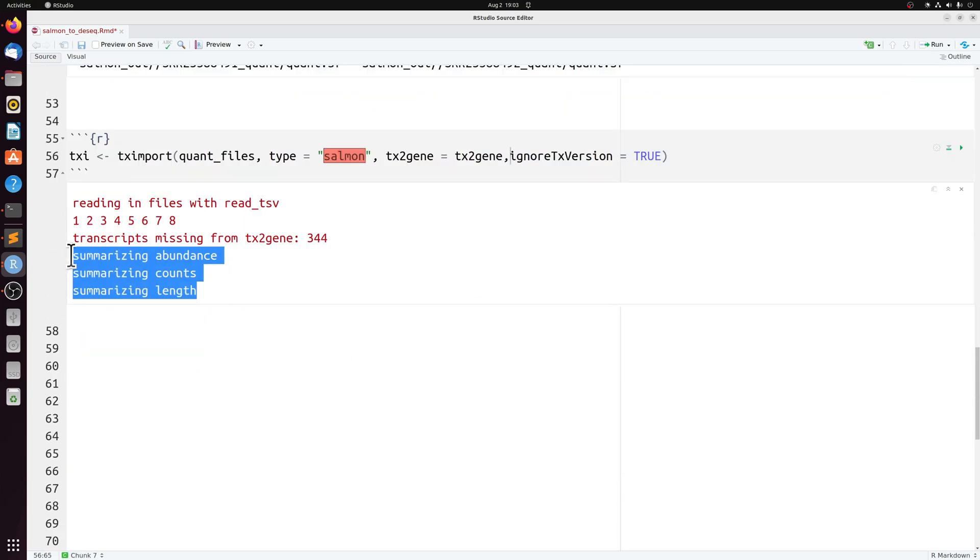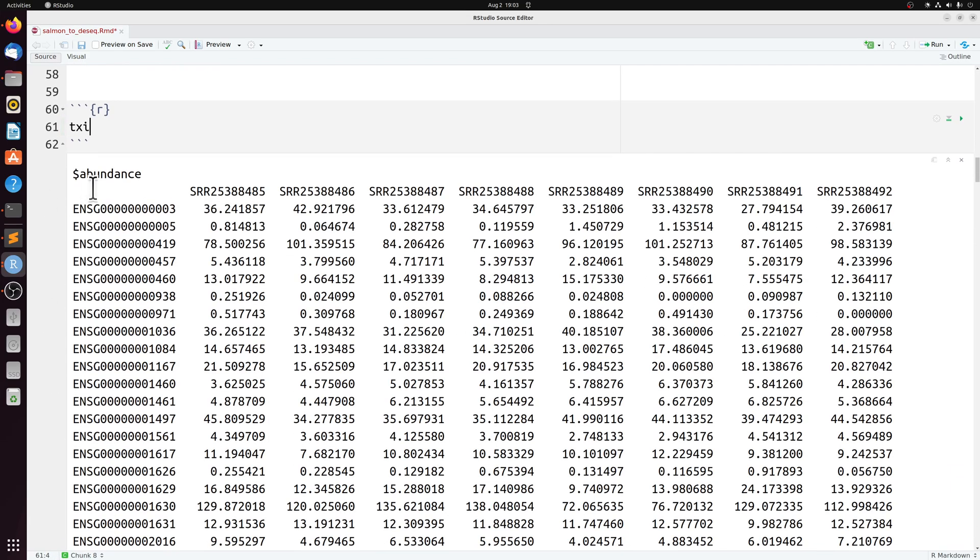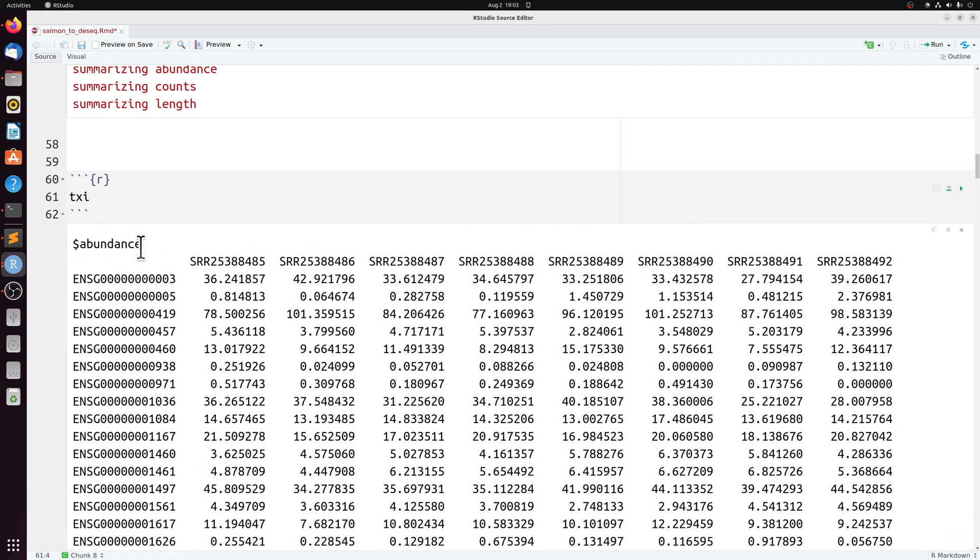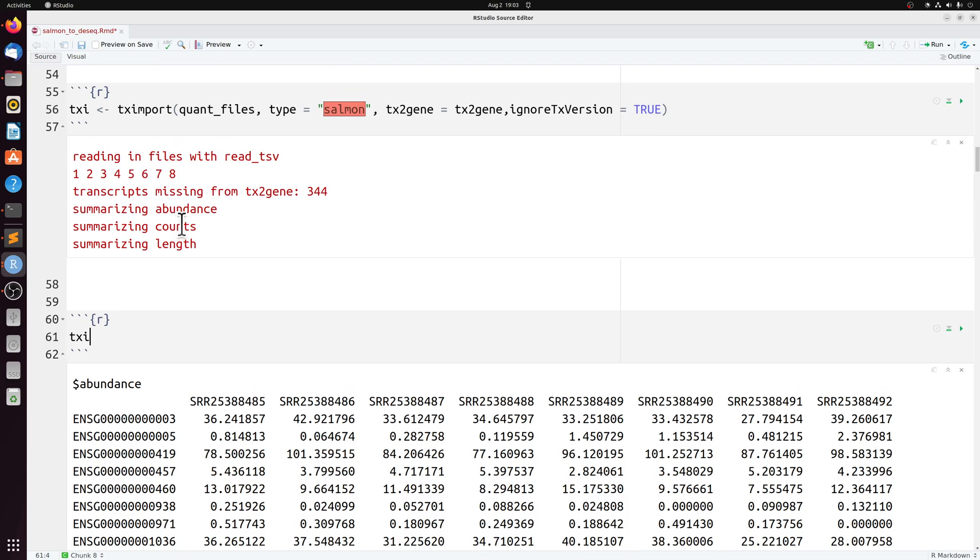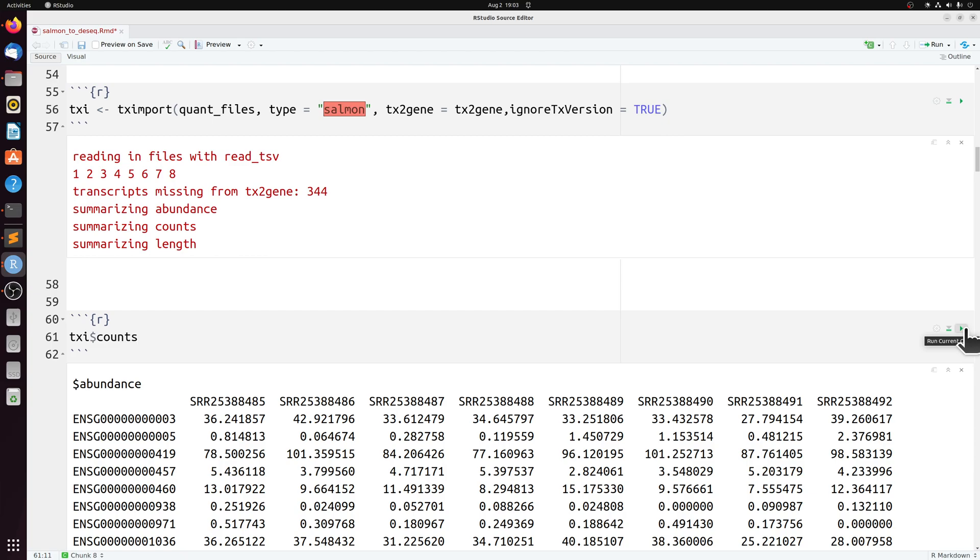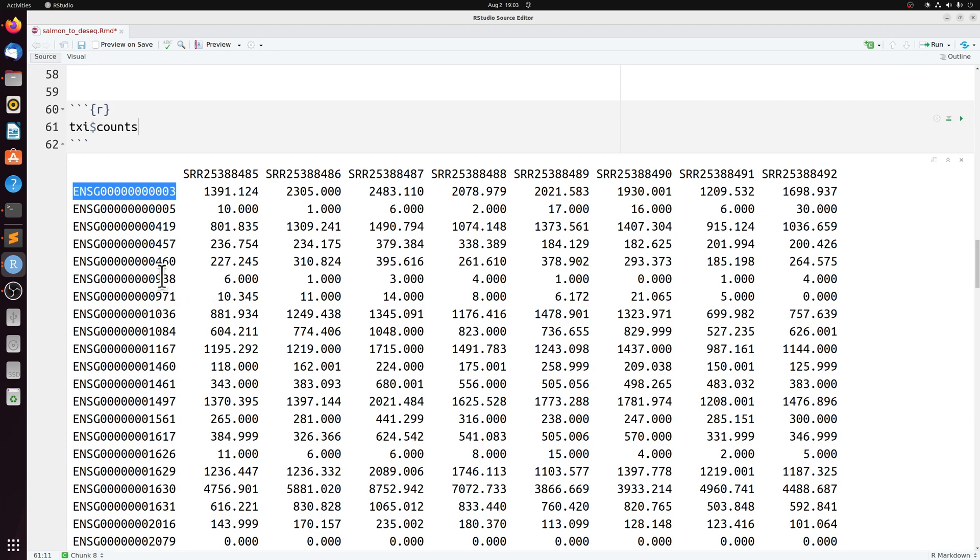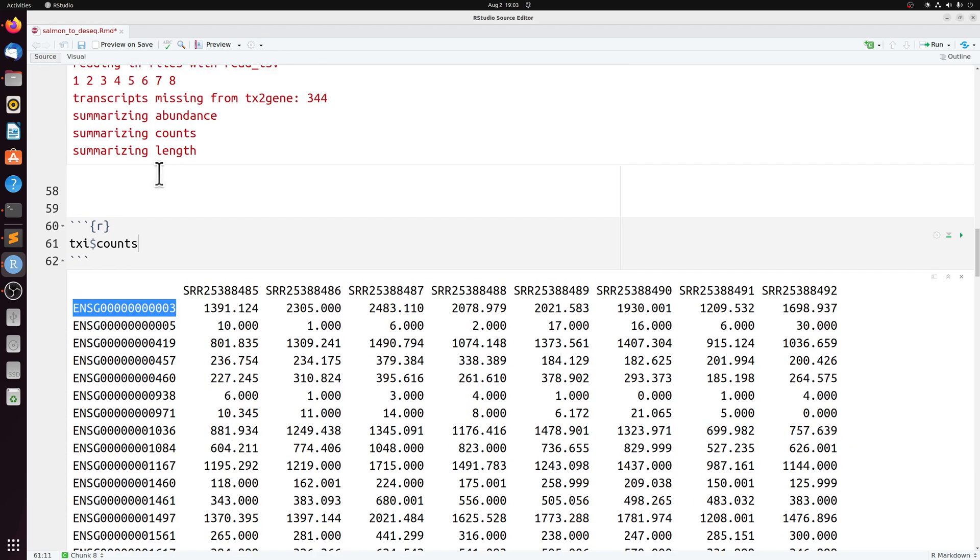So TXI is going to be this three component object with abundance counts and lengths. If you wanted to here, you could theoretically round the counts and then save it as a CSV. But these are your estimated counts on a gene level, not a transcript level.